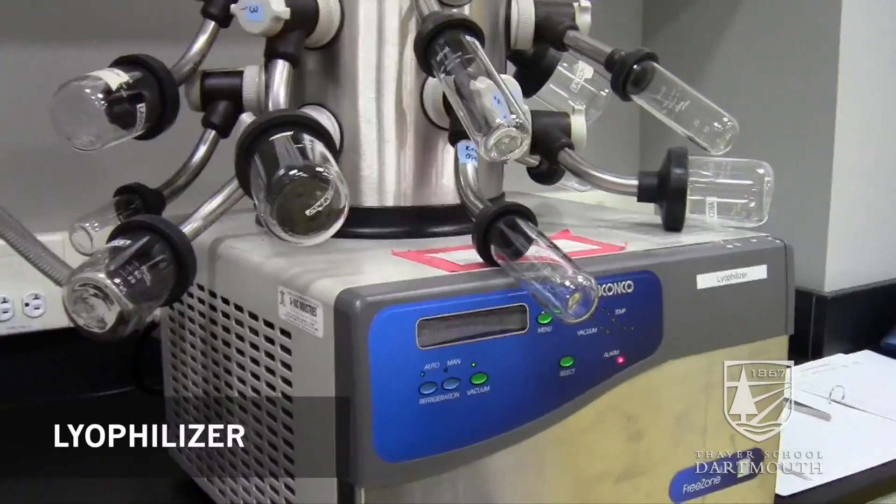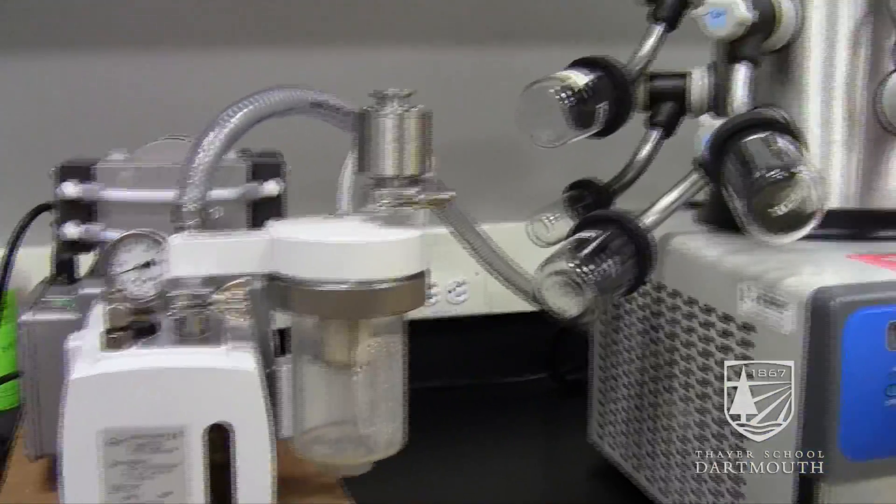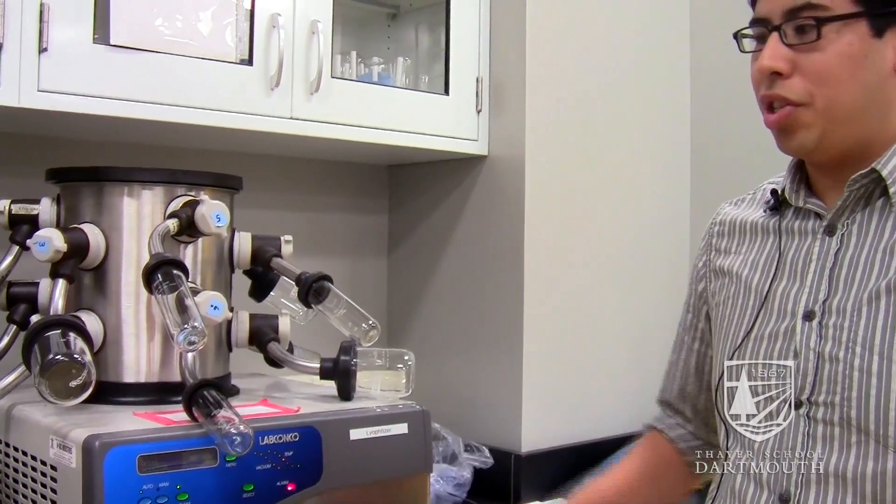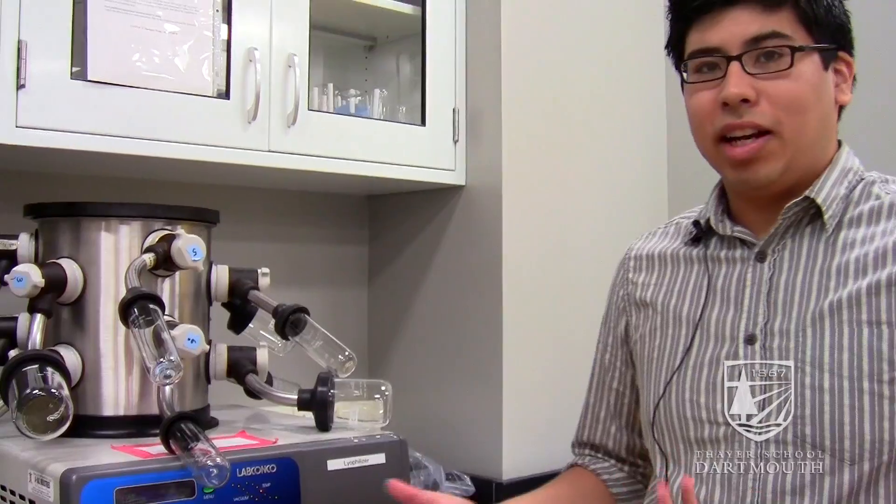The lyophilizer removes all the water without melting the sample. It's negative 40 degrees and the pressure is dropped very low so that the water is removed, leaving only the material we're testing.